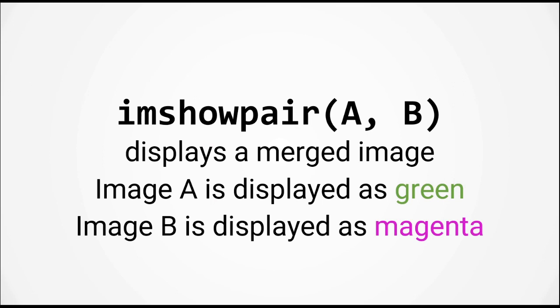This function takes in two input arguments, A and B, which should have the same size. The first input argument, which is the matrix A, will be displayed as a green image, and the second input argument, the matrix B, will be displayed in magenta. Let's switch back to MATLAB to try this out.